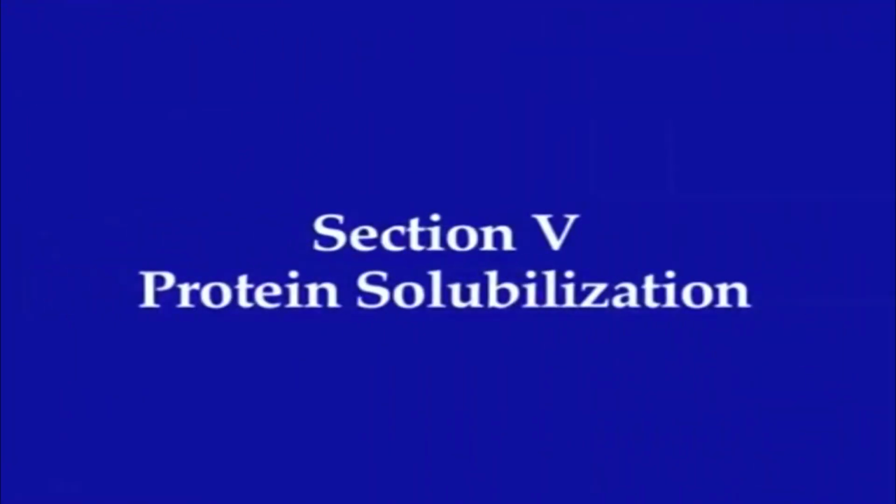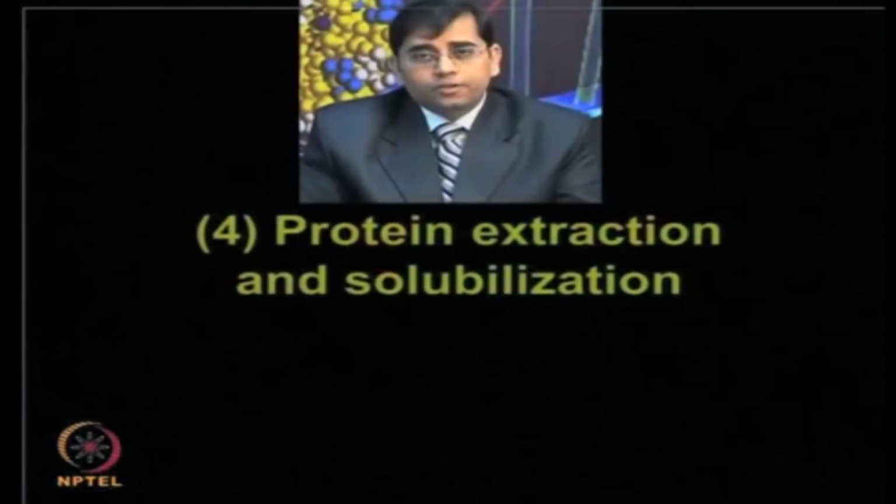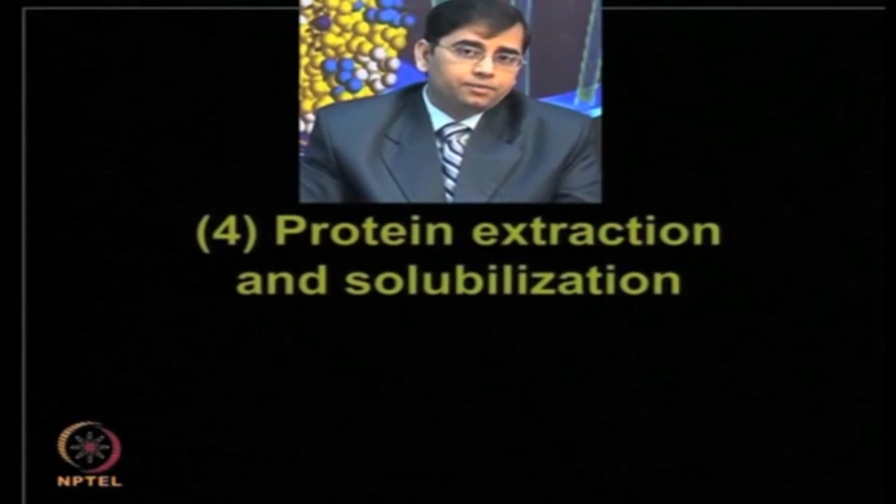So far we have talked about how to perform the cell lysis, then how to protect proteins from the proteolysis. We have then looked at different types of strategies people use to fractionate the proteome. And now, let us talk about protein extraction and solubilization.